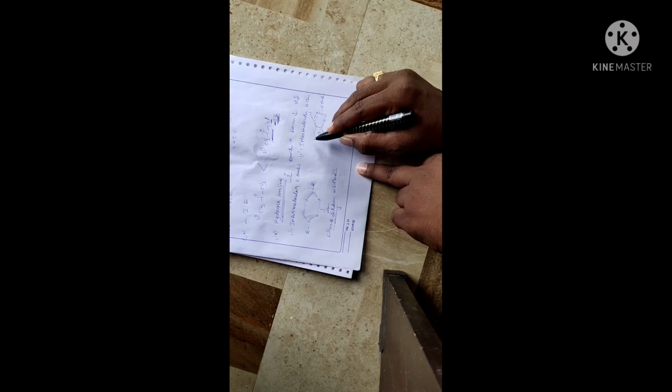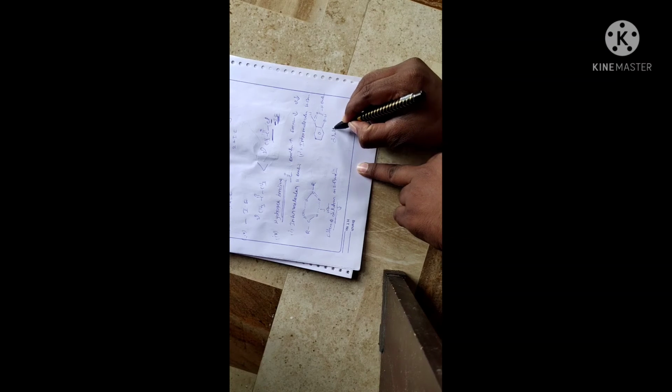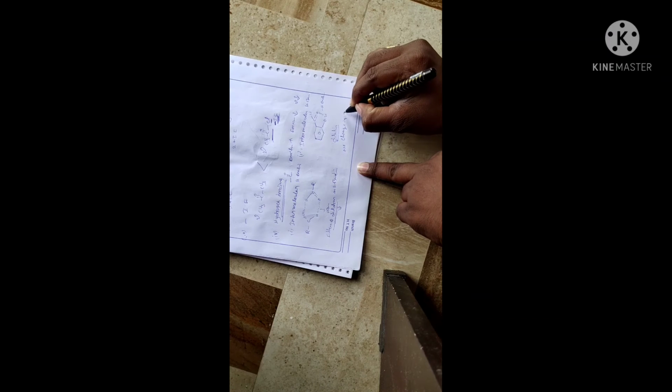But in the case of intramolecular hydrogen bonding, if you are diluting, there is no dilution effect, meaning as we are diluting, there is no change in frequency.